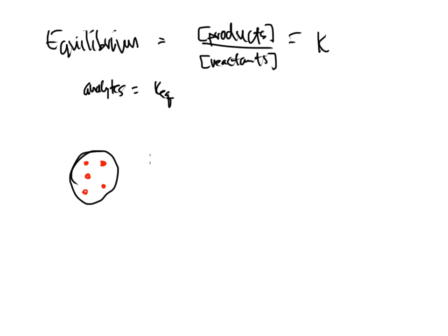Well, let's say that a second analyte comes through, and that also stays on the surface of the particle, but I'm going to see some of that kind of staying off in the mobile phase too. It doesn't stay as long on the surface of that thing. Because of that, we get natural separation that begins to happen. The K equilibriums, this whole hangout idea, can often be modified by playing around with pH. So this is why it's very important sometimes for pH to be controlled in your mobile phase and inside of your columns and inside of your samples.